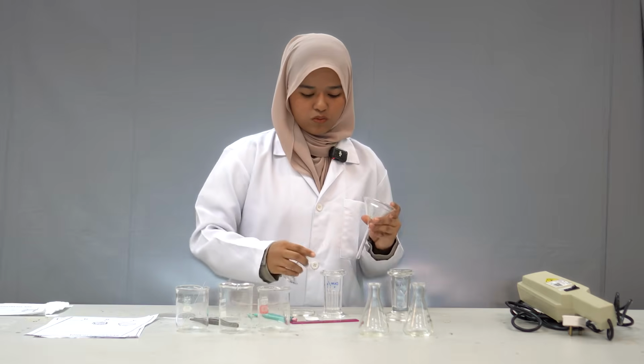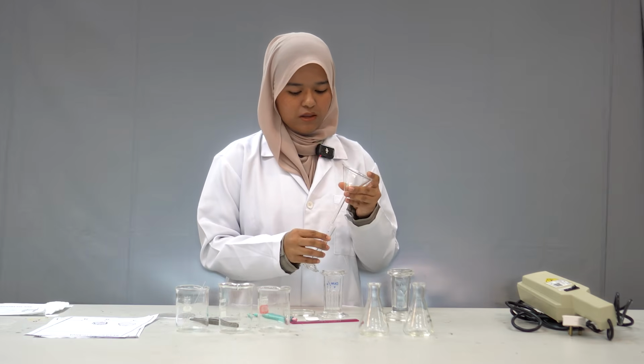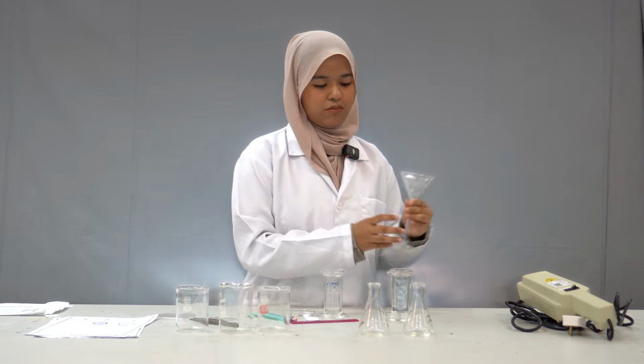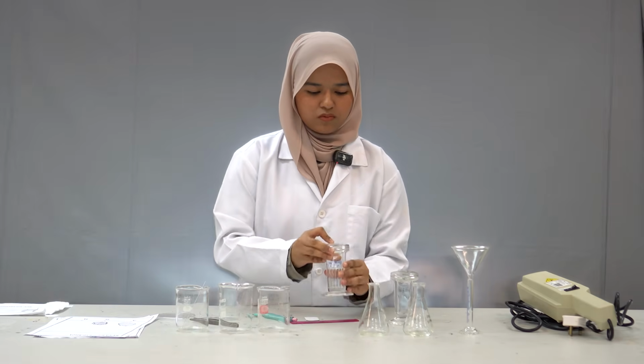Then this is put in each developing chamber. We do the same for the other chamber. Don't forget to close the chamber lid so that the solution will not evaporate into the air.